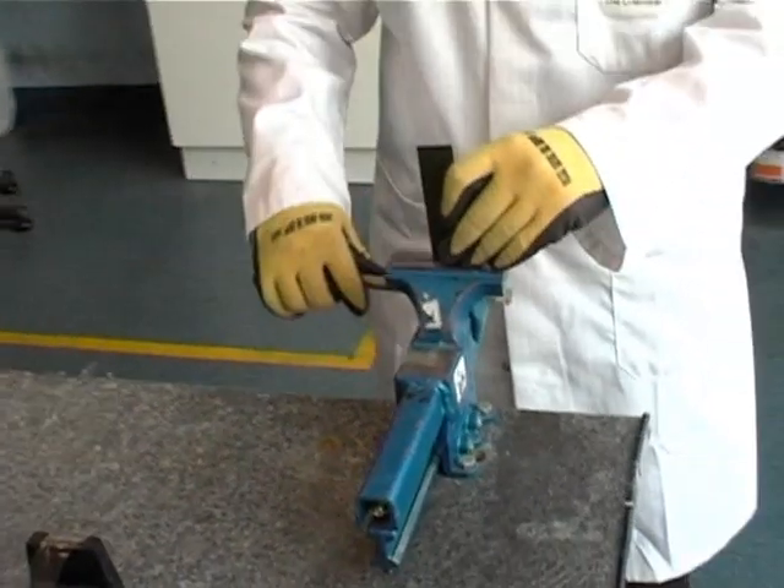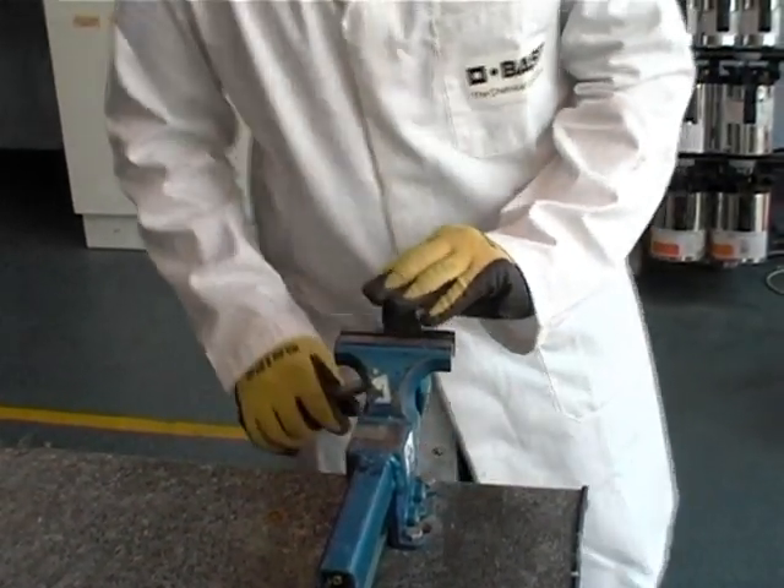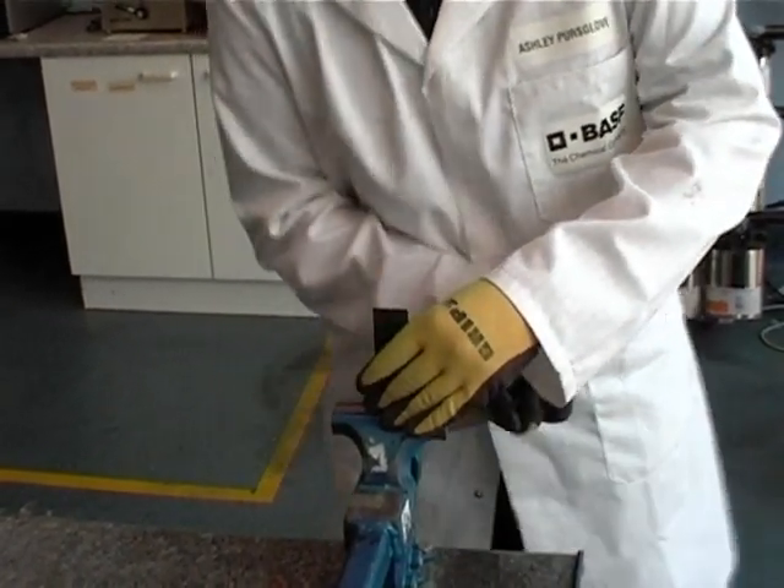The operation is then repeated, folding the sample back over on itself, this time forming a wider radius bend. Again, the bend is inspected for any signs of cracking in the paint.